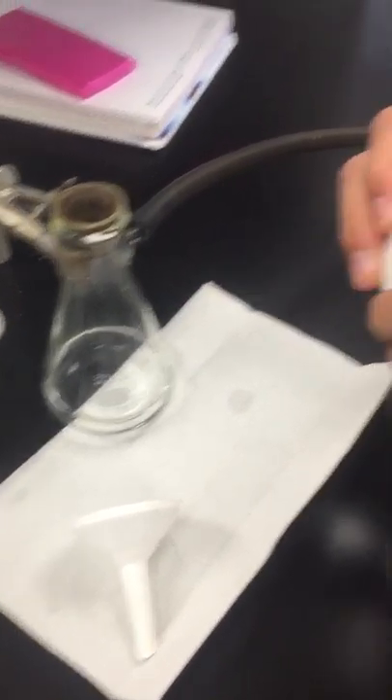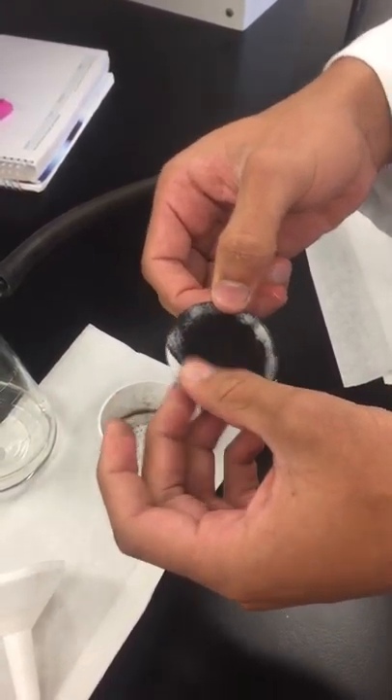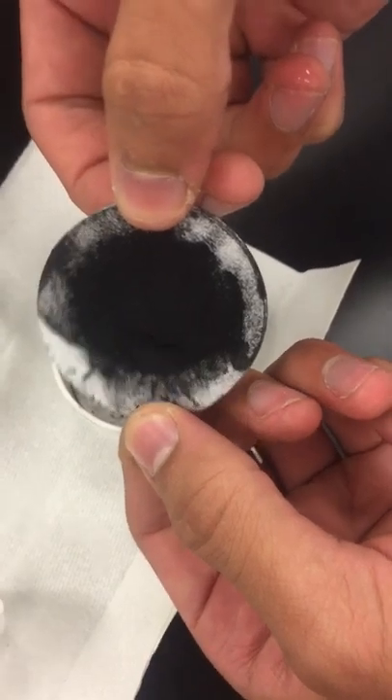If you ever need to get out your precipitate, you can take off the filter paper. There you go — activated carbon.